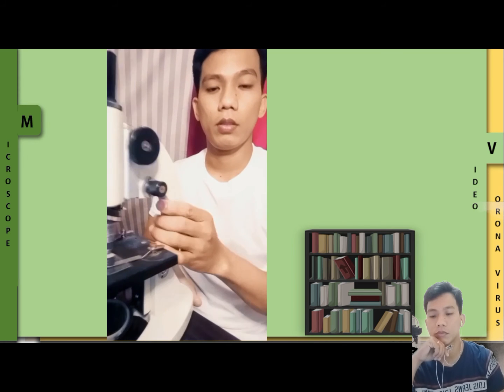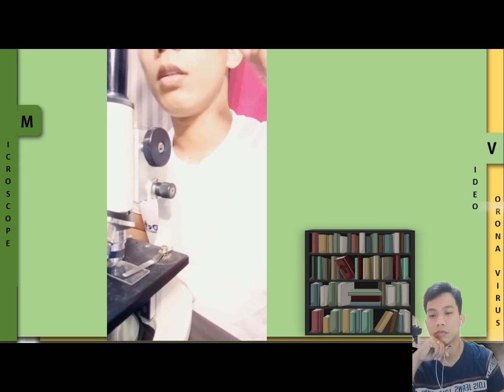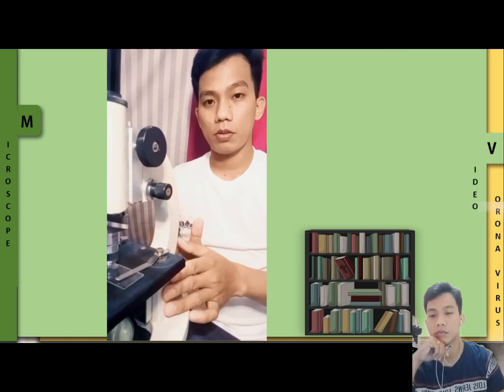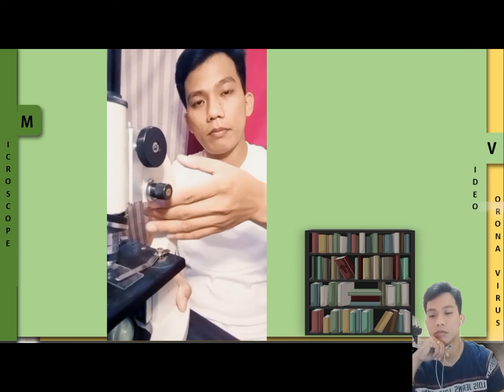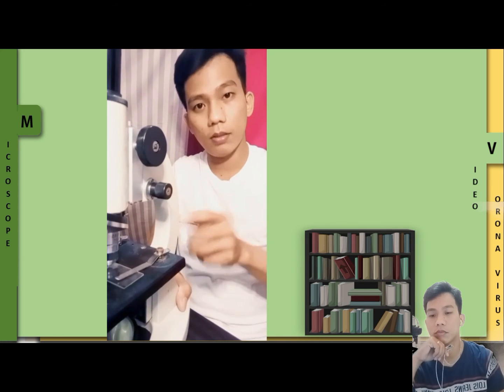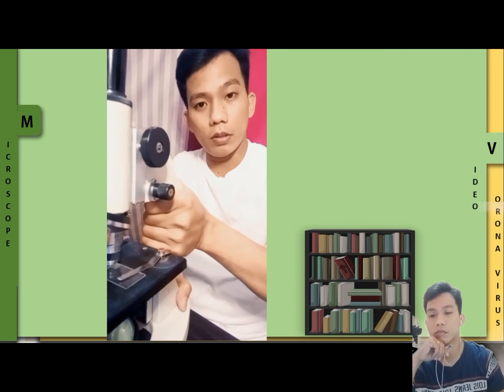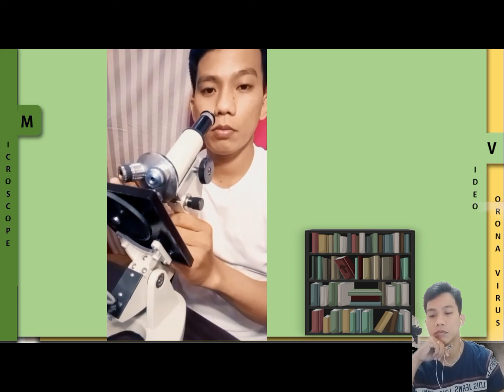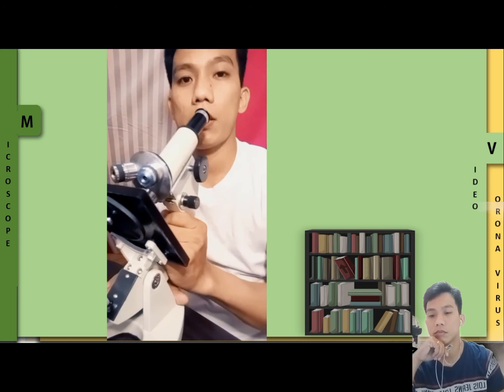Okay. So, instead na nakatayo ako at titignan ko dito sa mismong taas yung eyepiece, okay? Like that one. Ang gagawin ko na lang is gagamitin ko yung inclination joint. So, hawakan mo sa base. Hawakan mo sa base. Then, hawakan mo sa arm. Ito yung arm mismo. Then, pull mo lang backward. Okay, so, pwede mo nang gamitin yung eyepiece natin kahit di ka na nakatayo. So, yun. So, that is the inclination joint.